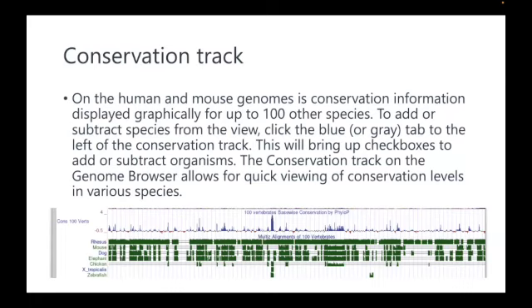All right. Let's move on. The UCSC shows the conservation track. The reason why conservation track is important is if some part of the DNA sequence is conserved over different species, it's more likely that that part plays an important role. If mutated, some bad results will happen.